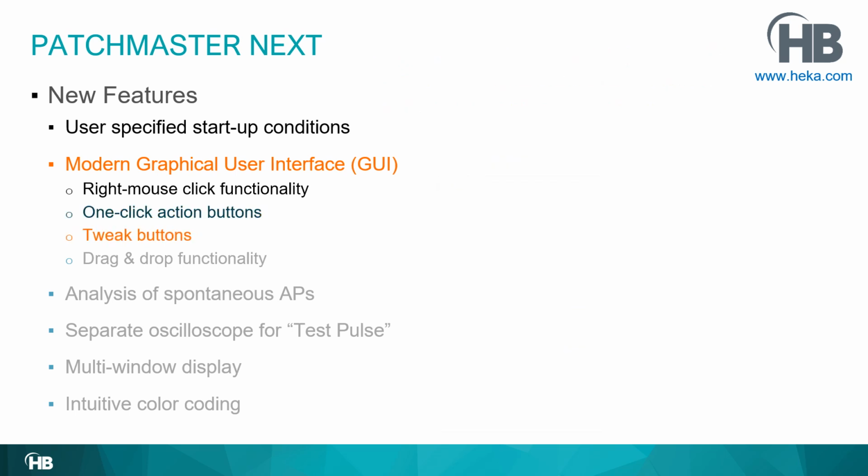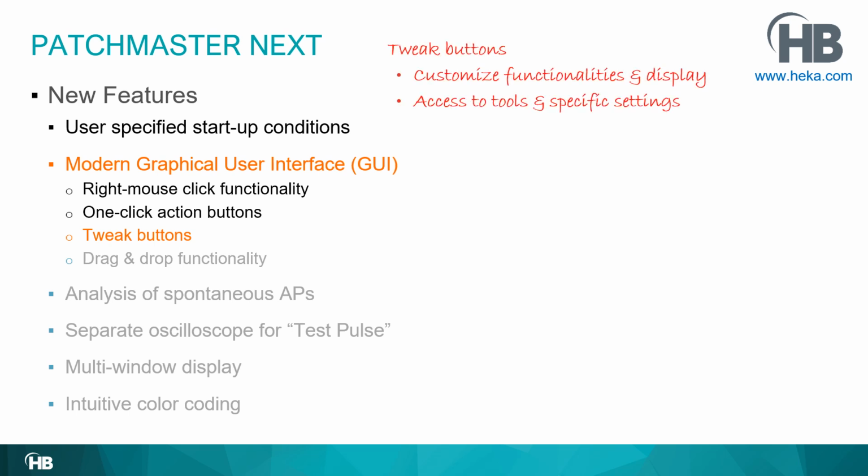Then there are tweak buttons. Almost every window has a tweak button that is specific to the respective window. And again, they have different functionalities. Some allow you to customize the functionality and the display of the respective window, or some give you access to additional tools or specific settings for that respective window.